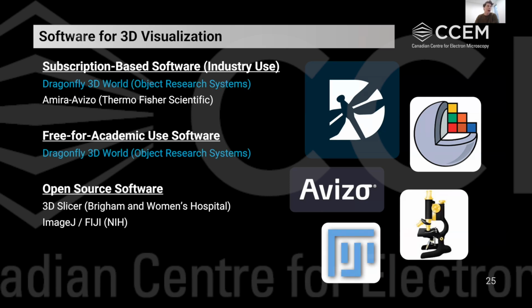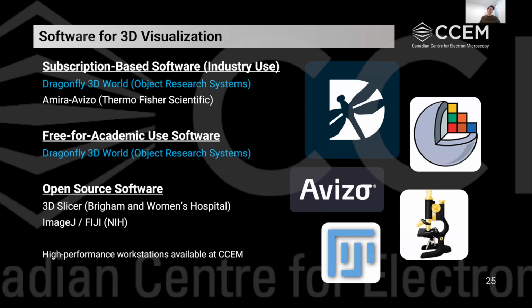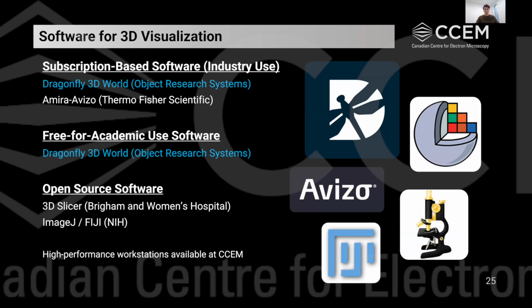Here at CCM, we have Dragonfly 3D World available for both industry projects and workstations available for academic use as well. So if you have a 3D FIB-SEM tomography data set you're trying to work with, you're welcome to use our computing resources to help process that data as well.